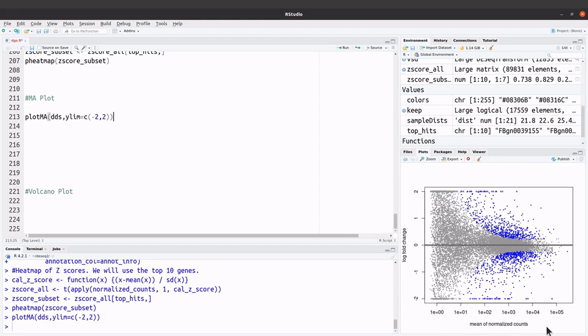We have our mean of normalized count and the log2 fold change. If you take a look at this MA plot, we have some points colored gray and some are colored blue. The blue points are those with adjusted p-values less than 0.1. You may see a different color but the meaning is the same — those points have adjusted p-values less than 0.1.